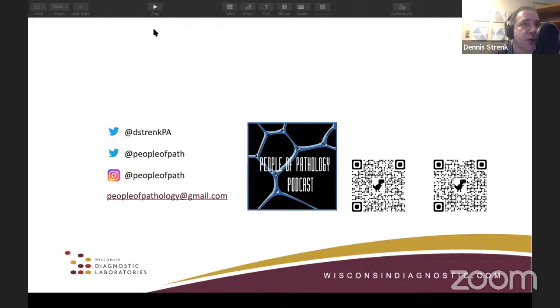And another trick you can do, if you've got 2 lymph nodes that are relatively the same size and you want to bisect each of them, is to ink one, usually black, maybe blue, and then you bisect them both, and you can put them in the same cassette. But then you have to include that it's 2 lymph nodes bisected, one inked black or blue or whatever color you happen to use.